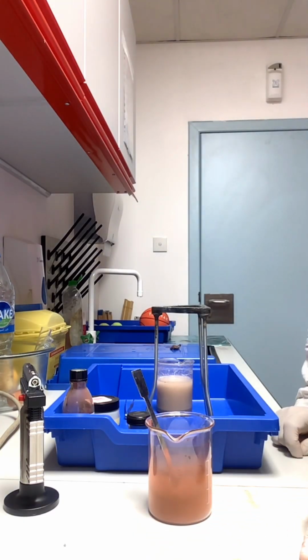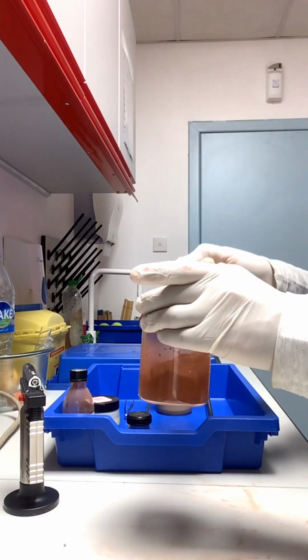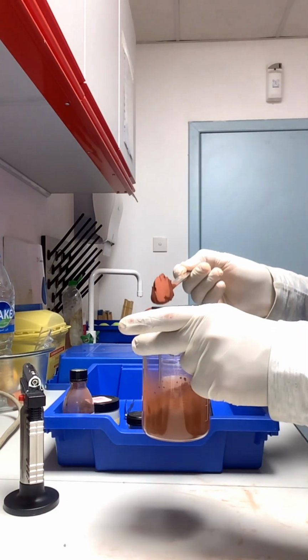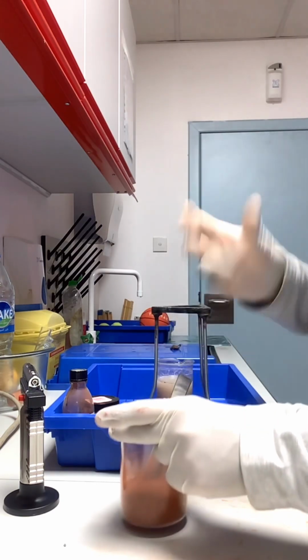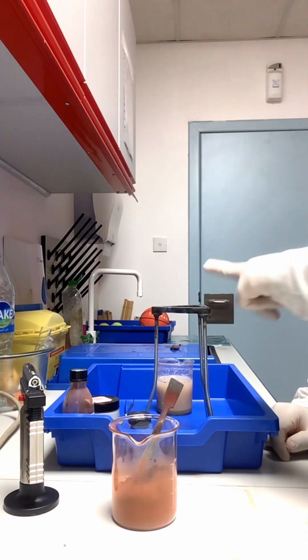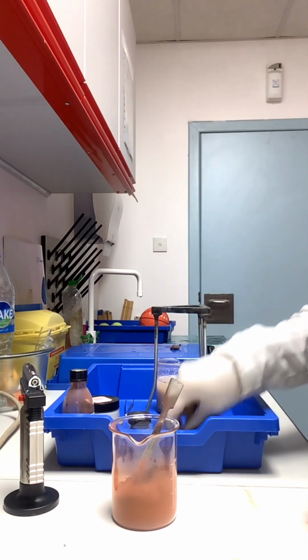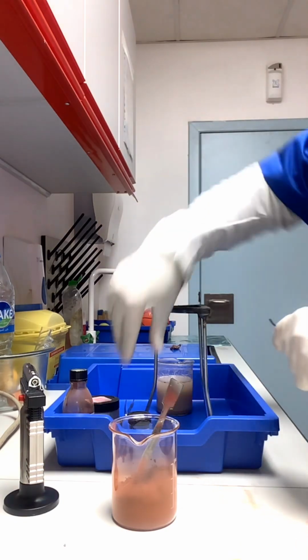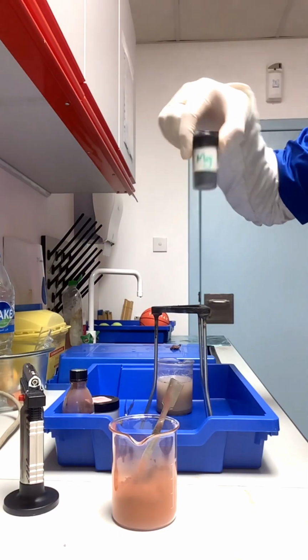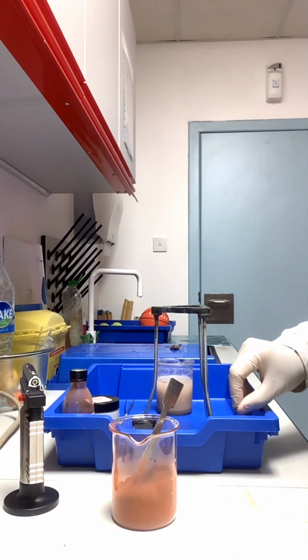So the first step is to place a little quantity of the iron oxide and aluminium powder into a crucible, and then you place the crucible on your tripod stand, and then place a magnesium ribbon on the top with some sprinkles of magnesium powder. So I will set it up for you and show you how it looks.